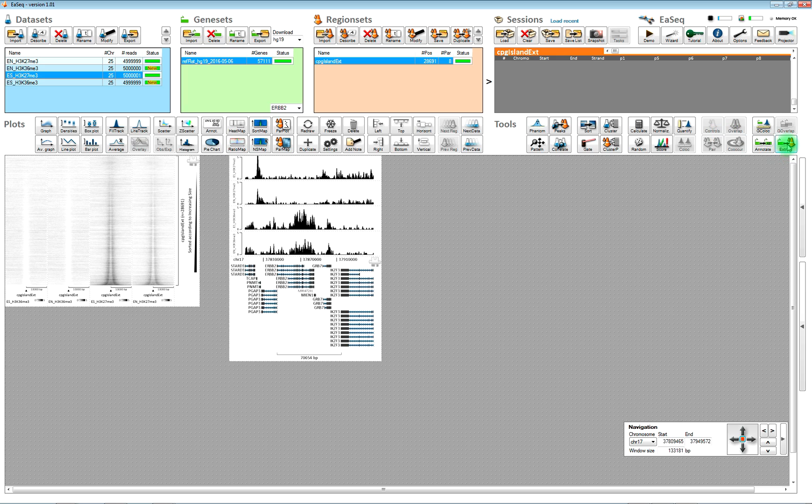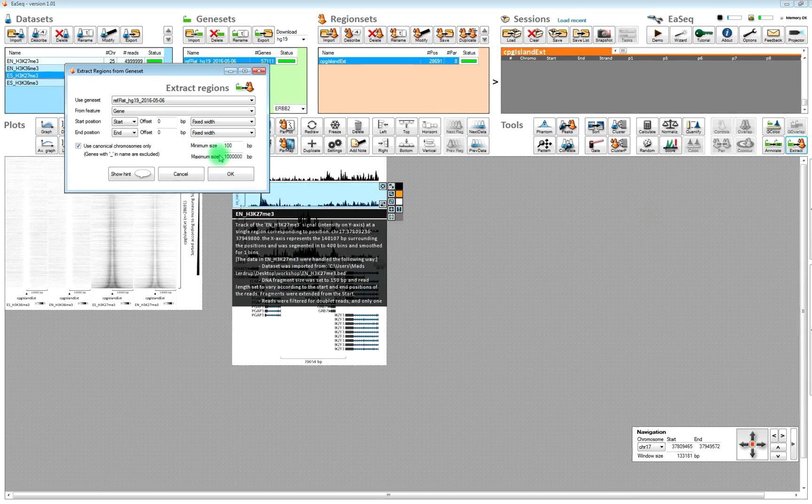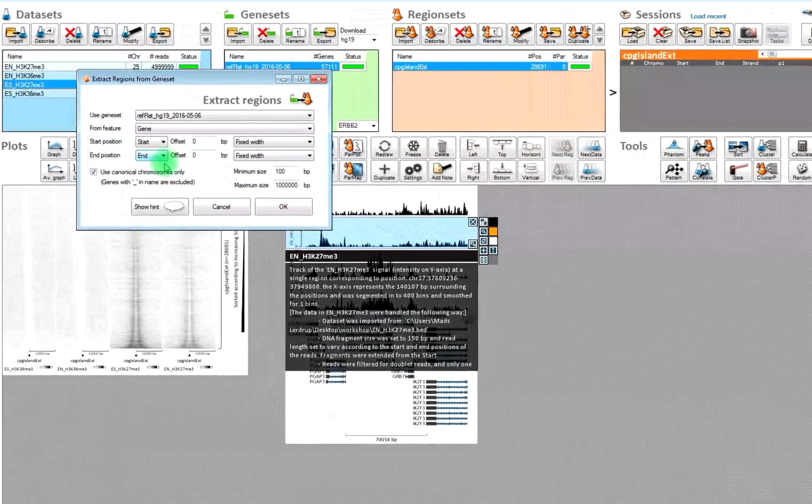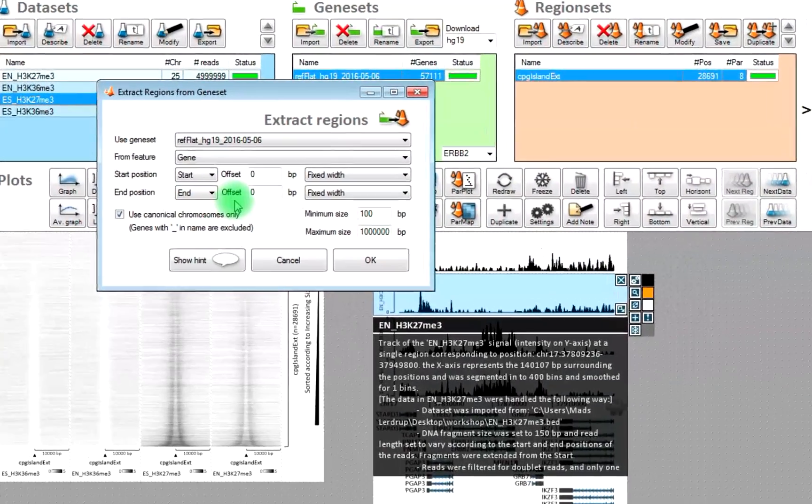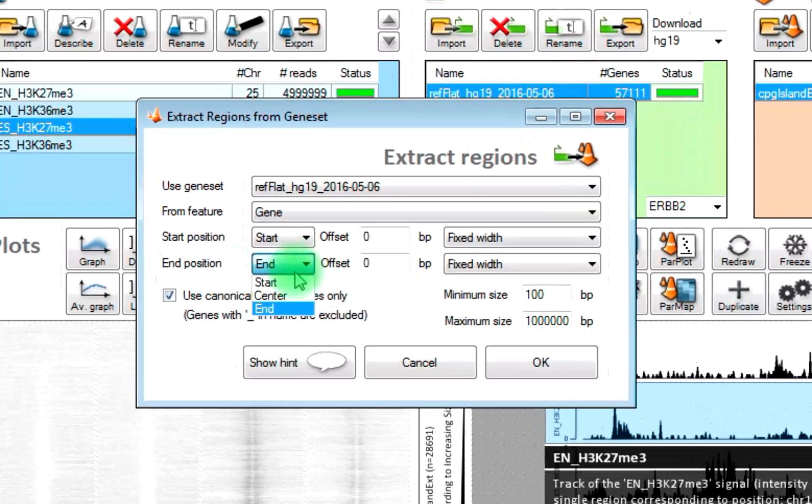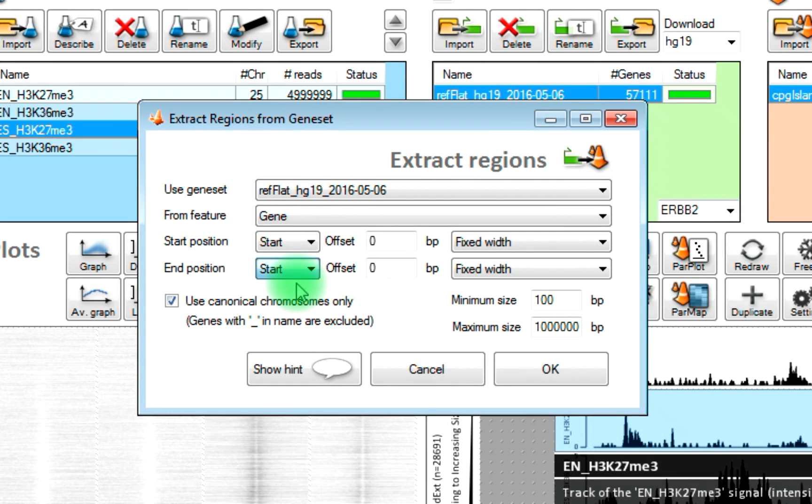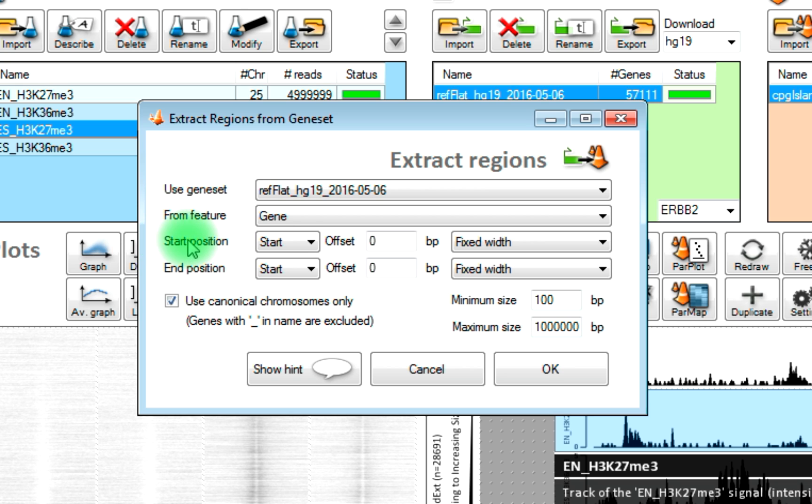We use this tool over here for that. And if we for instance wanted to extract the transcription start sites, then we change this setting to start. Then we are creating some regions that go from the start of the gene to the start of the gene.